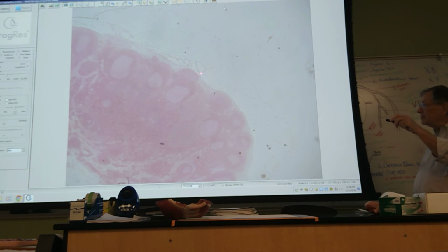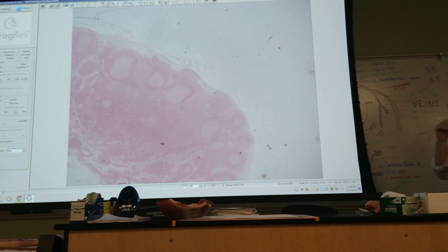They look similar to veins. So you have these vessels, they're called lymphatic vessels. They're found in the pericapsular tissue. And they have a unique feature. Because your lymphatic system doesn't have a heart that is a pump, it actually will show you how it flows slowly.